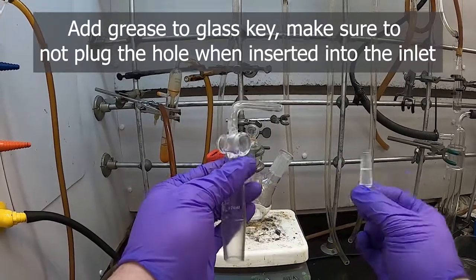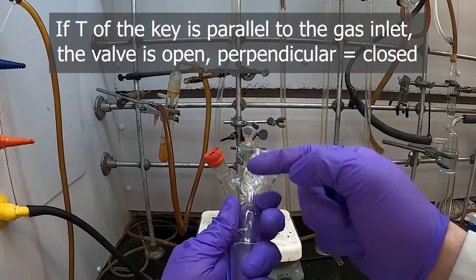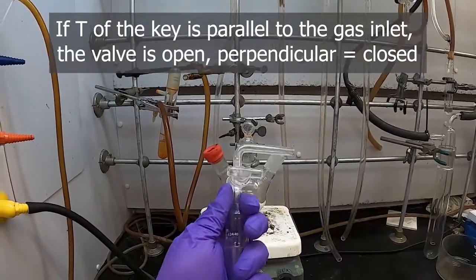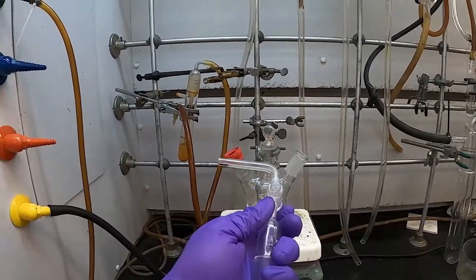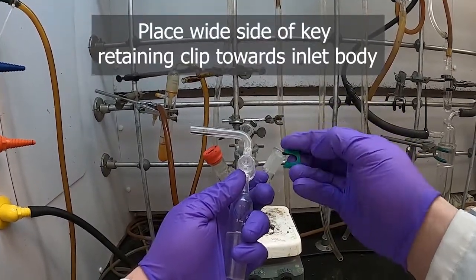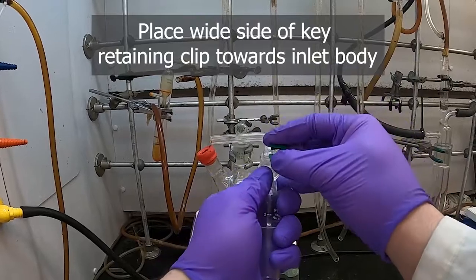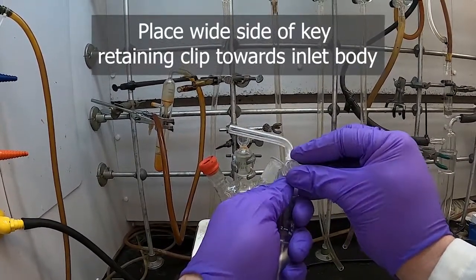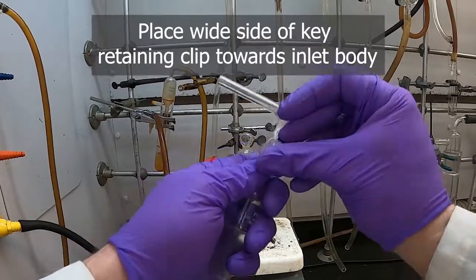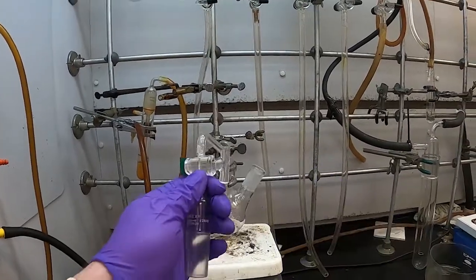We'll take our gas inlet piece, stick it in, give it a couple of rotations, and then you want to line up so that if the handle portion of the key is lined up with the valve, then it's open, and if it's perpendicular to it, then it's closed. So we'll leave that open for now. When we turn it over, we have this little metal clip here, which has a wide side and a smaller, narrower side. The narrower side will go up, and there's a notch in the back of the key. You want to force down that clip so that the narrower side catches under the notch. Like that. So now our key is retained and it won't fall out while we're using it.